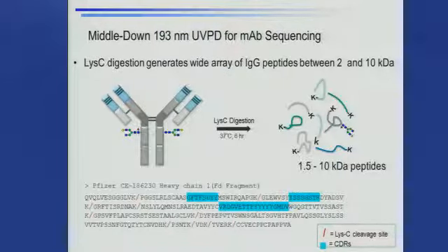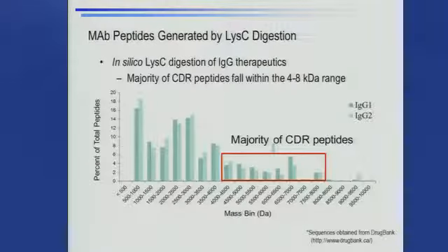And as shown here, if you look at an in silico map of what you would anticipate for digestion using this Lys-C, each of the peptides ends with a lysine, and they're fairly substantial size peptides. In addition, the blue regions are some of these key complementarity determining regions, and you can see they're intact within these large peptides. So we maintain the integrity of these key CDR regions.